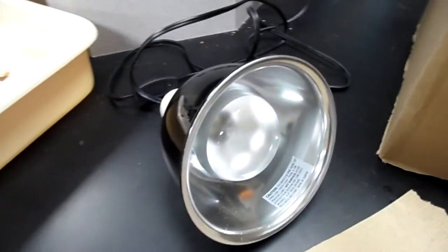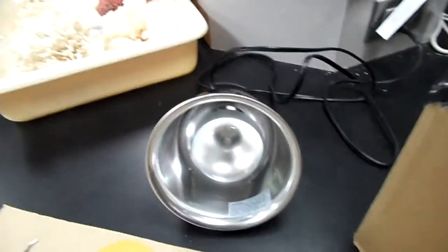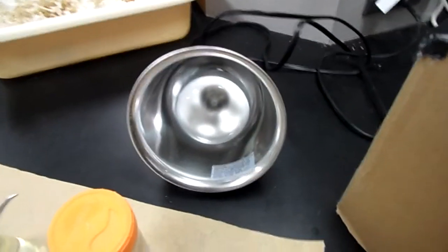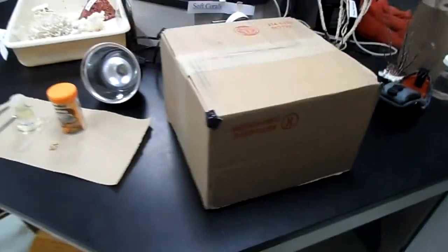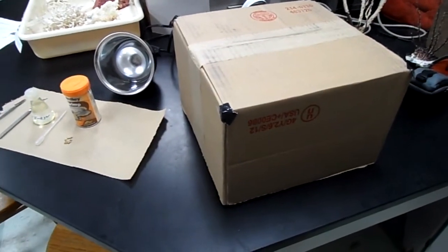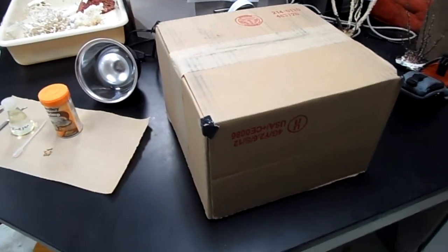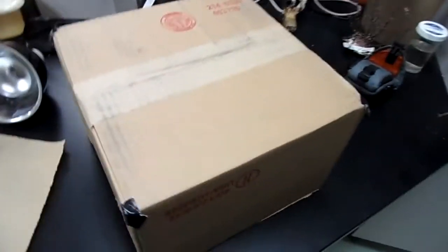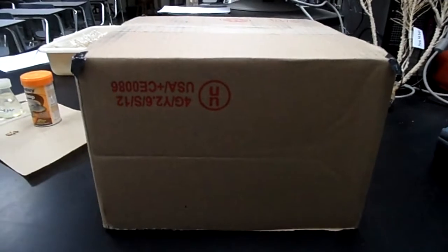This is a rather powerful lamp. So in addition to uncovering the anemones, I'm also going to turn on the lamp and shine the lamp on them as soon as I uncover them. So the idea here is to see what they're doing in the dark. As soon as I uncover the box, you'll see what they're doing in the dark and see if there's any kind of reaction to the light, or any kind of behavior that you can assume is a reaction to being exposed to light all of a sudden.